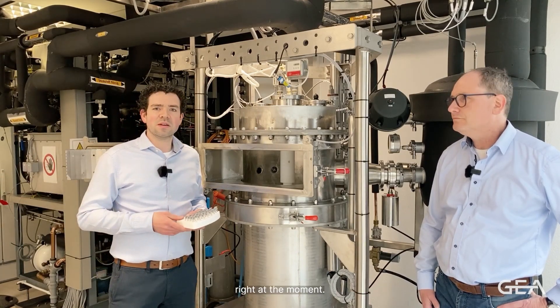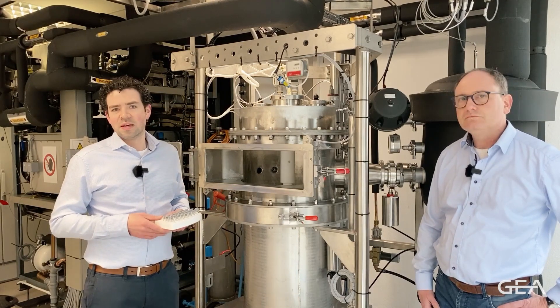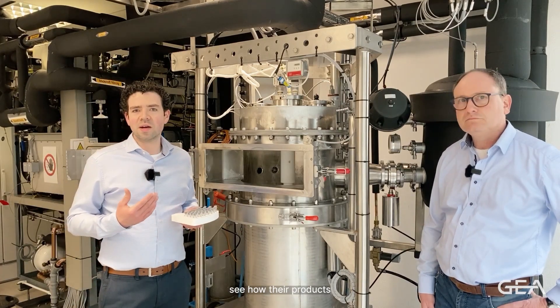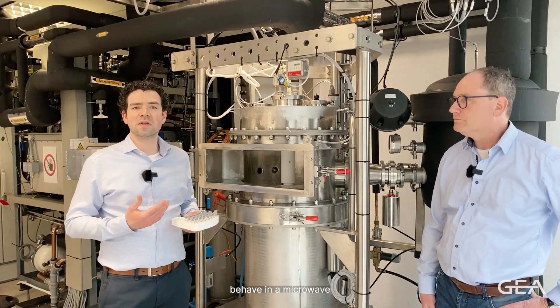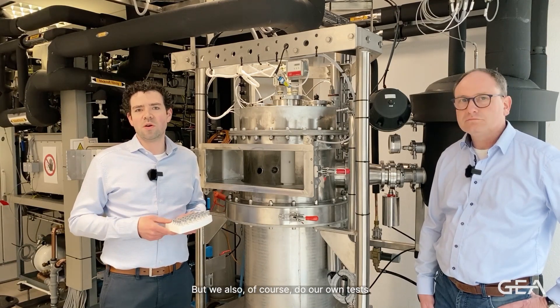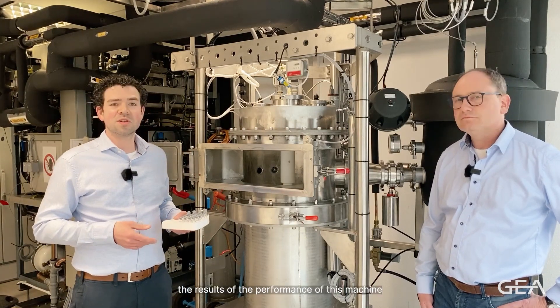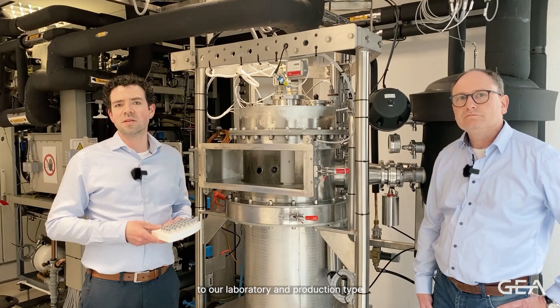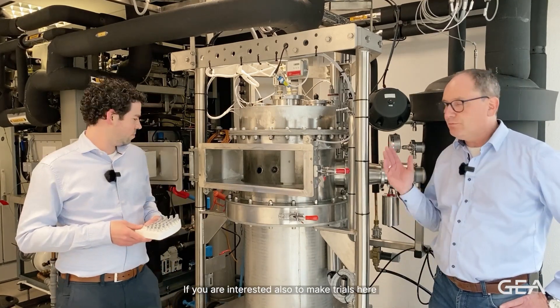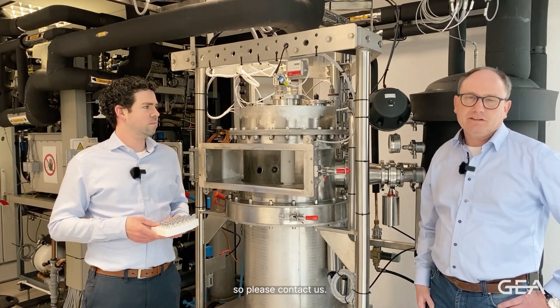Right at the moment, we are working together with several customers to really see how their products behave in a microwave-assisted freeze drying process. We also of course do our own tests, where we compare the results and performance of this machine to our laboratory and production-type freeze dryers. If you are interested in making trials here in our company at this machine, please contact us.